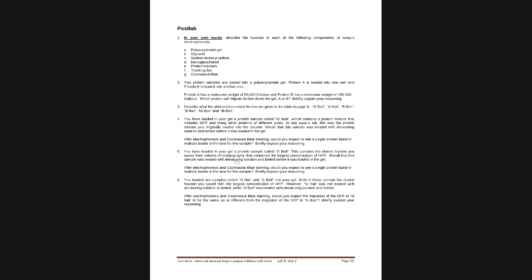But in this, you'll come across the questions where it asks about what does a GBOIL, GNAT, or IGBOIL mean, or the IBBOIL mean, and all that. And then it's going to ask you to compare these samples as far as how many lanes you would expect and things of that nature.